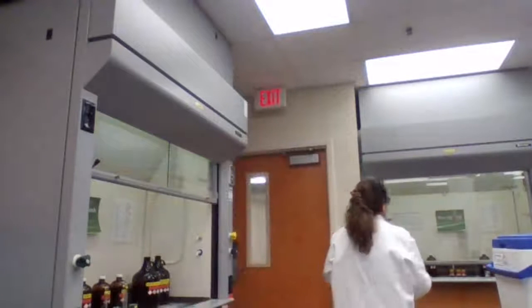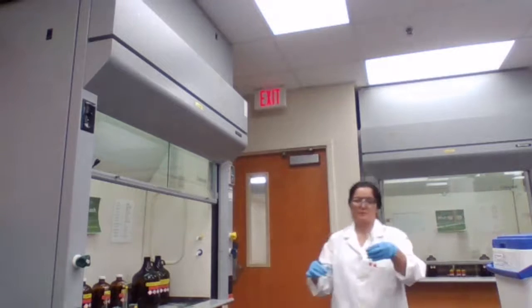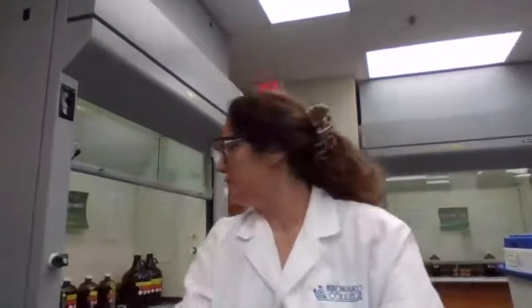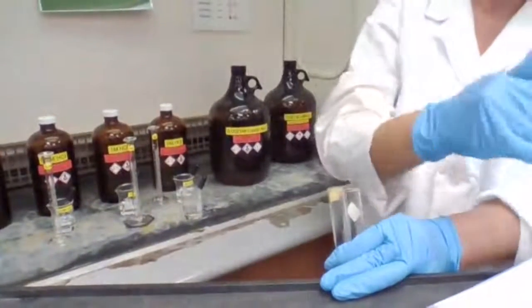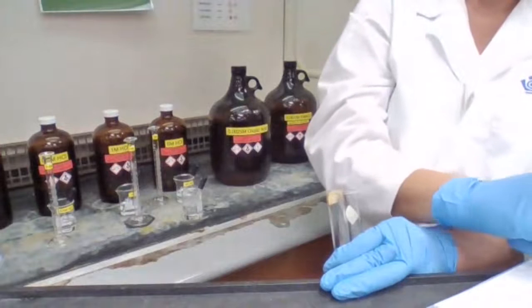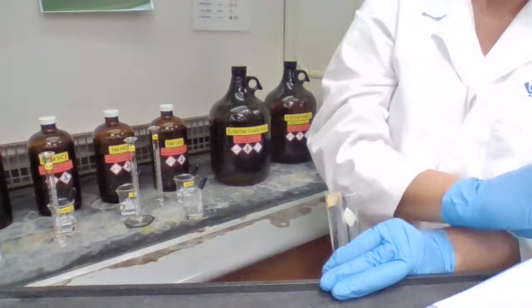I'm going to take you to the fume hood, so we can add the concentrated HCl dropwise to both tubes while stirring until we see some changes.